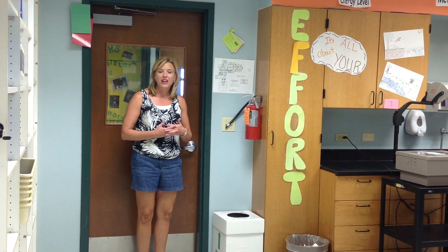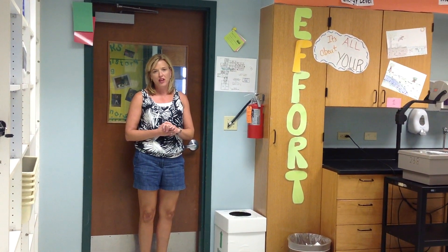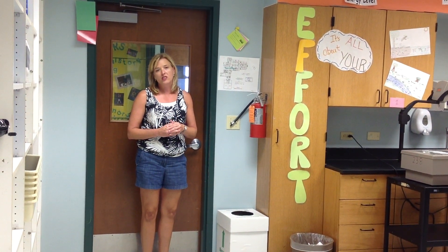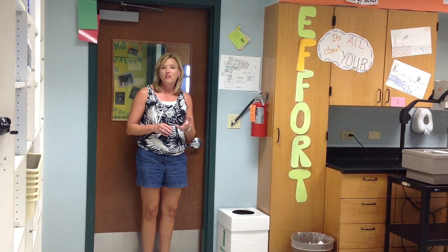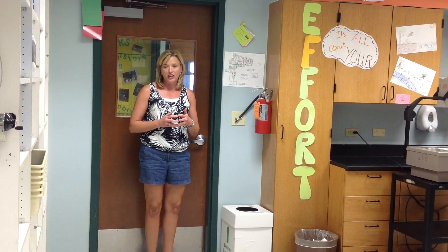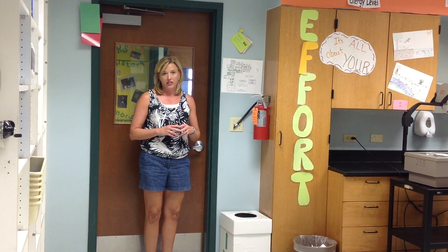Hi, I'm Mrs. Bradling and I'm one of the 8th grade science teachers. We are going to be doing several videos this year, and the first video is going to be on the basic safety equipment that you have in all of your classrooms. All of you may have either Mrs. Robinson or Mr. Mitchell as your science teacher, but all of this equipment is in the same area and location in all of the classrooms.